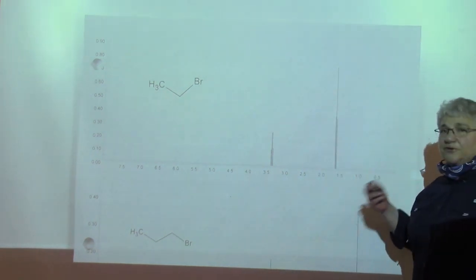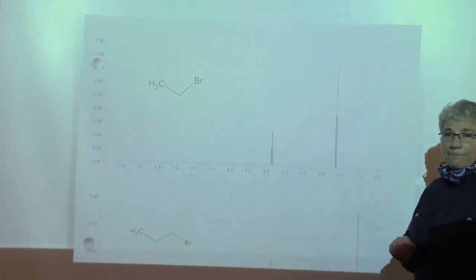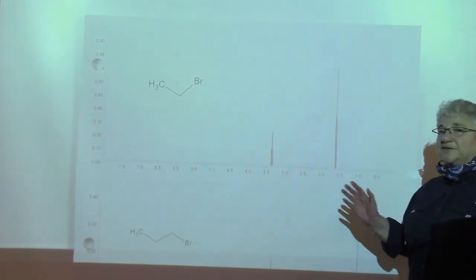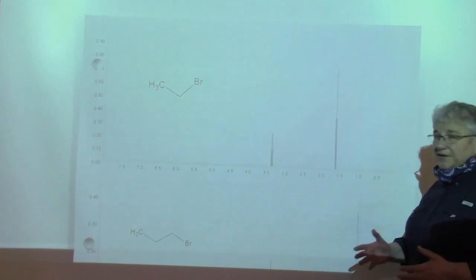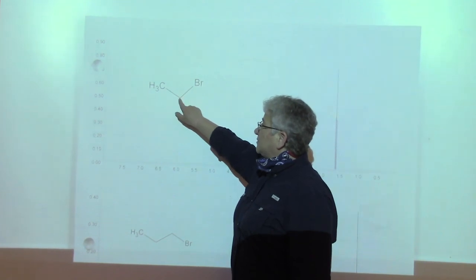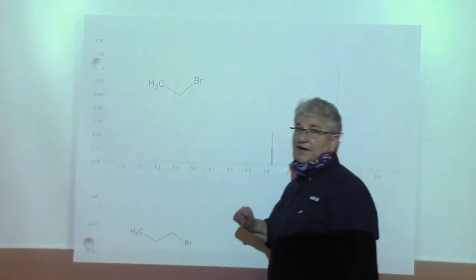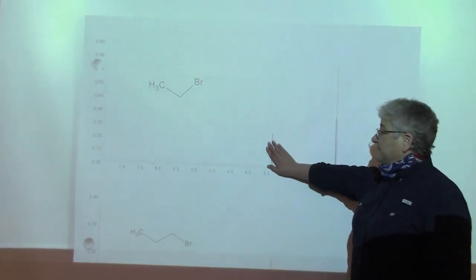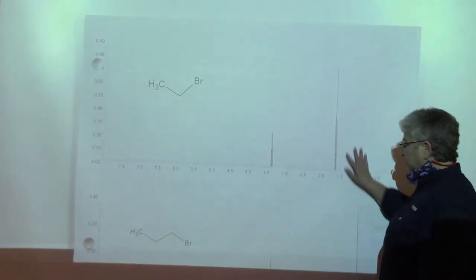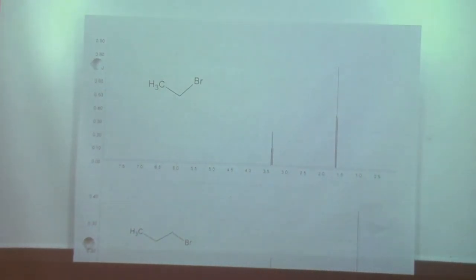And in fact, you see 2 different kinds, right? You see one kind here and one kind here. And hopefully, if I made you guess which one of these was which, without knowing anything else, you would say, well, these 2 hydrogens are bound to a carbon that's bound to a heteroatom, and that tends to pull things downfield. So I'm going to guess that these hydrogens are these 2, and that these upfield alkane-like hydrogens are those. And I would say you're absolutely correct.